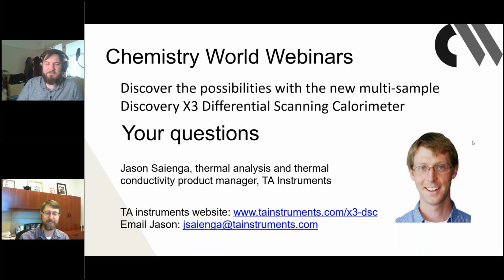Shonak asked, is it possible to run 3 different types of experiments simultaneously on the X3? Well, obviously, there's one test that you're going to run, and so each sample is going to go through the same program. So if you want to start at minus 90 degrees and ramp to 300, cool back down, and ramp back up to 300 again, all 3 samples are going to have to go through that same experiment.